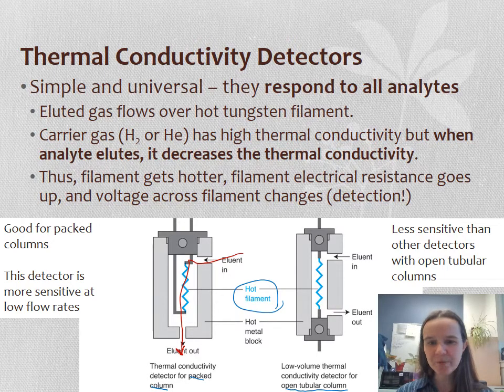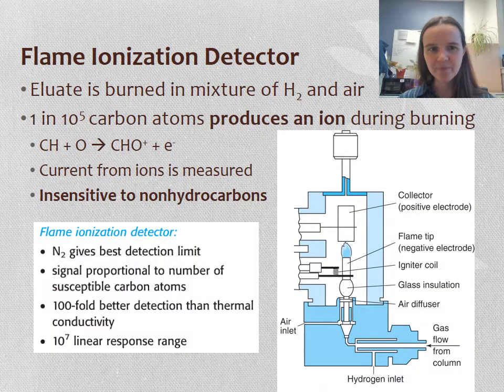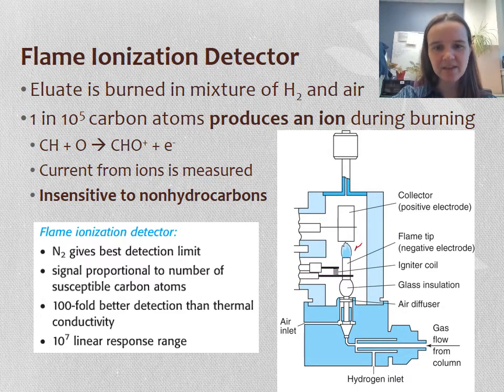It's still possible with open tubular columns, but it's less sensitive than other detectors. But like I said, universal, works for all molecules. The flame ionization detector is not universal. What it is, you have a flame, right? So here's our flame right there, and you're burning the analyte.